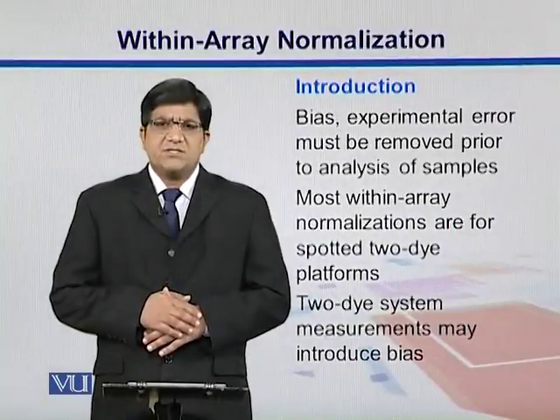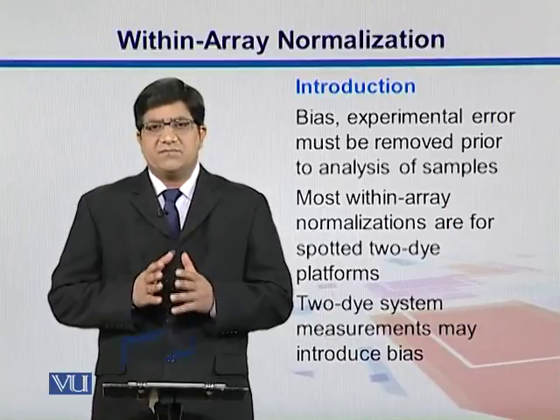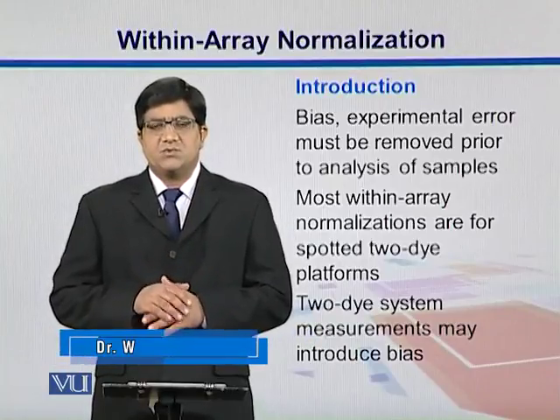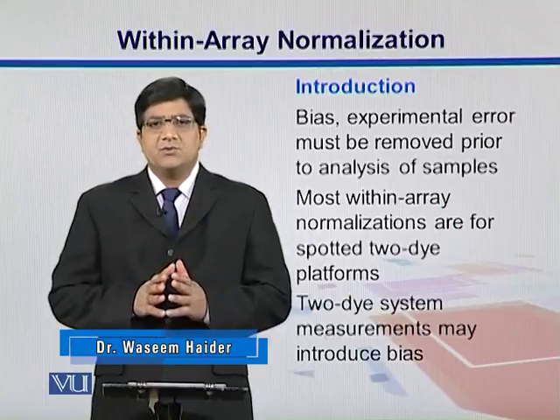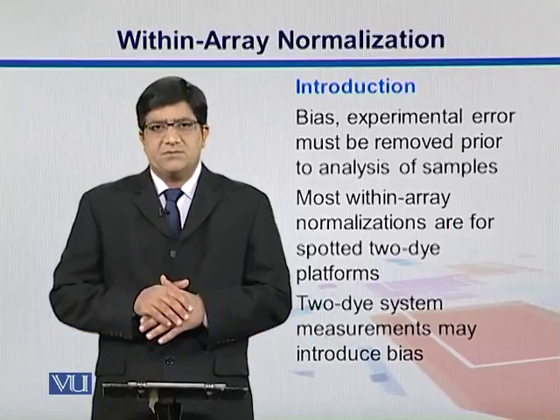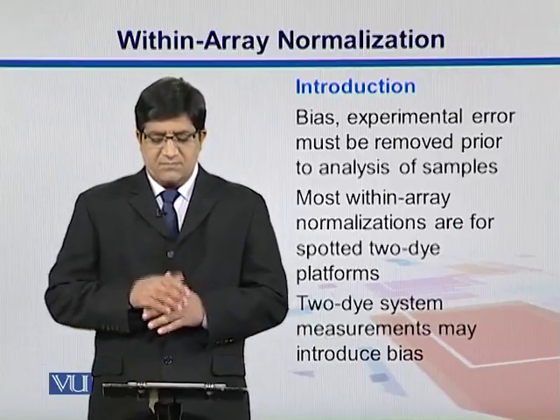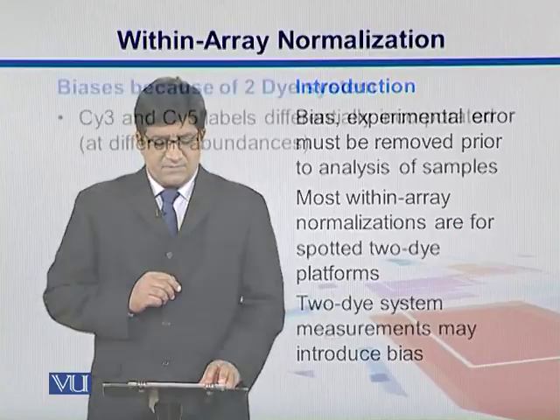Within array, normalization techniques are important for those experiments in which we are using those differential dyes. Since we are using those different colors, and there is a tendency of different RNA to bind differently with either of these two dyes, we need to do this normalization as far as these data is concerned.